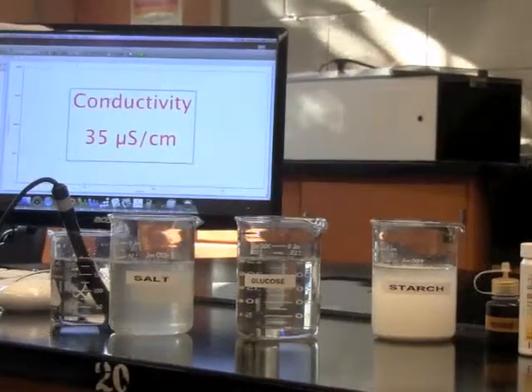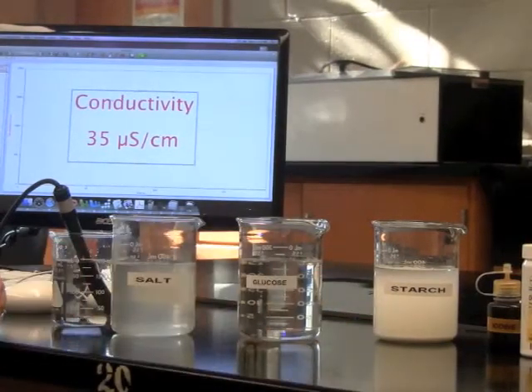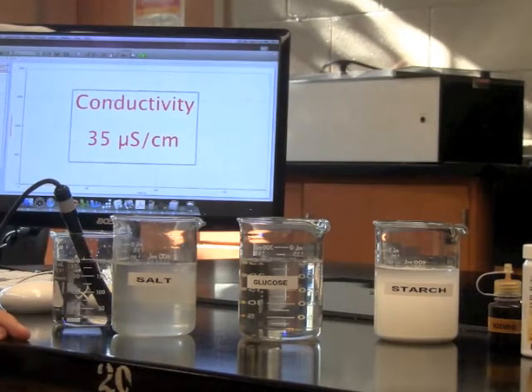All right, biology students, here we have three solutions that you might find in lab. We have a salt solution, a glucose solution, and a starch solution. And we also have ways to measure how much salt, glucose, and starch are diffusing through a membrane. So we'll start with salt.